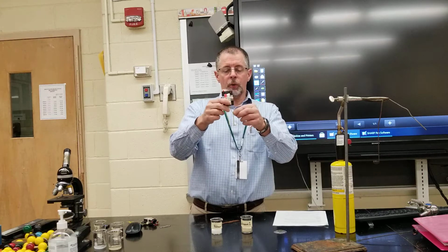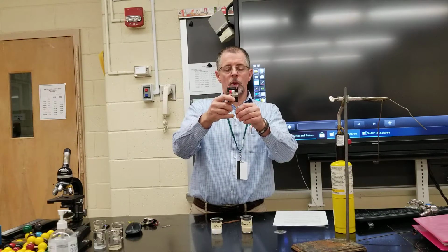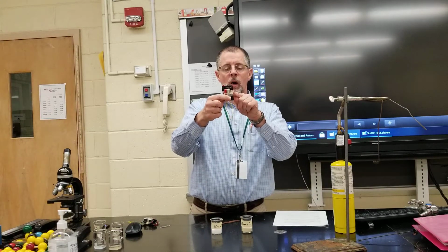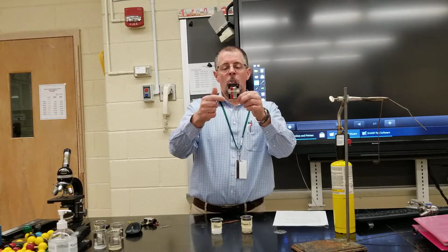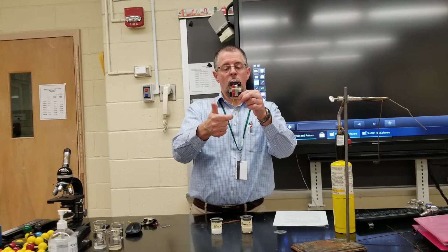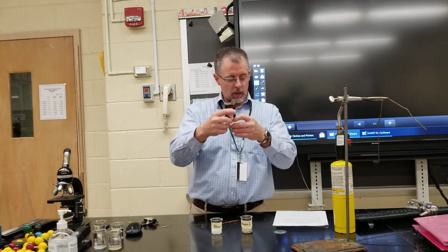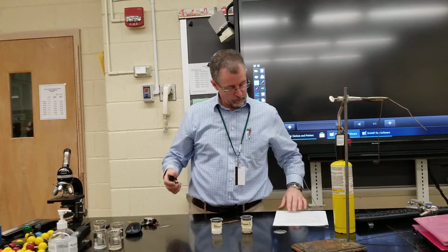You could also simply touch the two electrodes together and we see it lights up, because what you're doing here is, again, continuing the circuit. The mobile electrons are traveling down this wire and passing the charge onto these mobile electrons, which are completing the circuit. So we see that the meter is working.